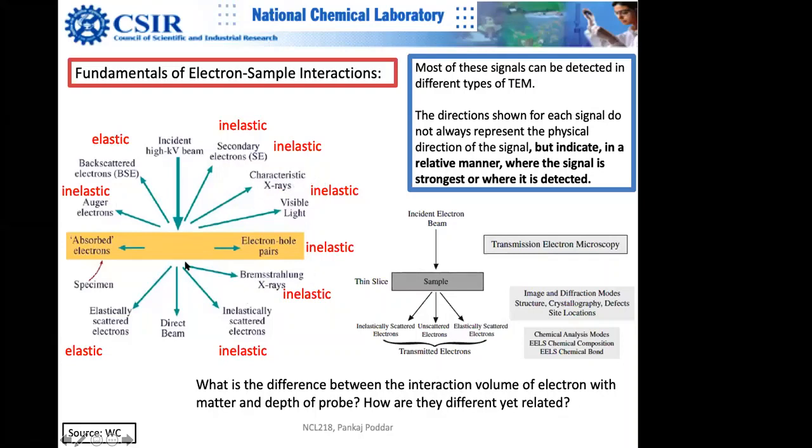Fine. So now you can have electrons which are going too close to the nucleus. So it's like a slingshot. These electrons are thrown like a slingshot. Many times students ask me this question: can you explain how this scattering happens? So basically backscattering is a very prominent signal here. Backscattered electrons carry the information about the entire charge.